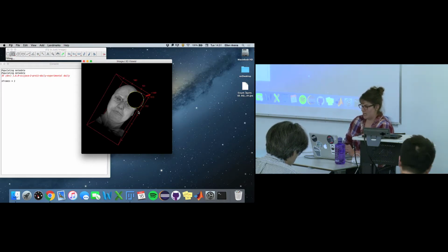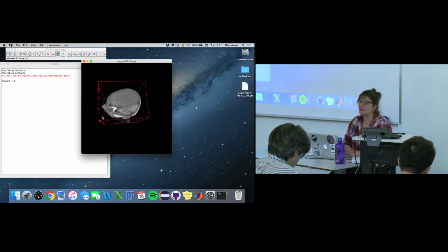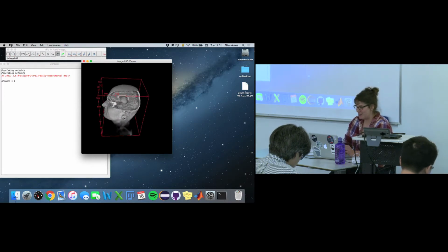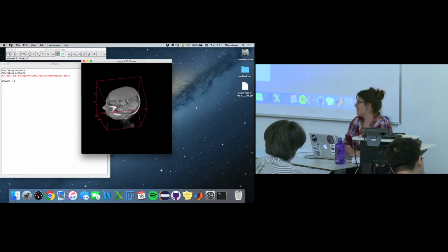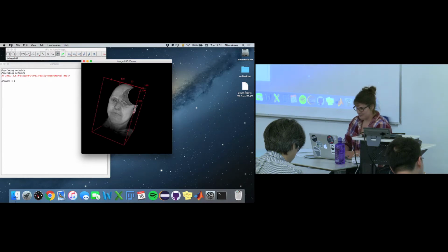And now when you rotate, you have to go back to the little hand at the top so we can rotate again. We actually took a slice through his head. Kind of cool. I always like doing it over the eye, because then you can see his eye socket. Maybe I need to see a shrink or something, but I think it's really cool. So it's just another way you can see your data, okay?